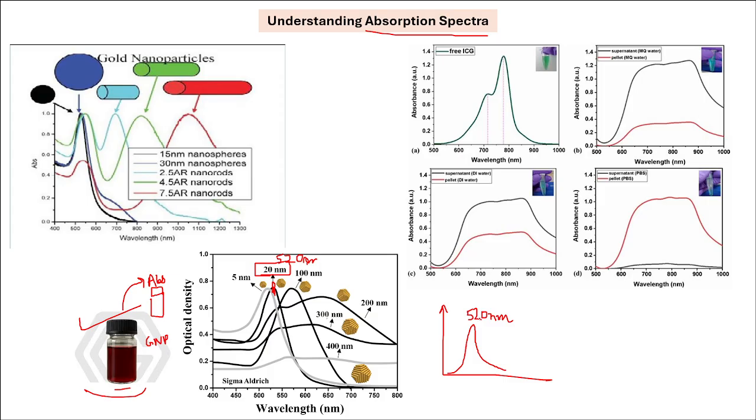You have to experimentally validate with other techniques also, and all those techniques shall correlate with each other in order to conclusively say that whatever nanoparticles you are proposing, that we are synthesizing gold nanoparticles, these are spherical in shape, the size is 20, the diameter is 20 nanometer. So in order to say that conclusively, you need to corroborate each of the different findings with each other. Now we'll see one by one how that happens.